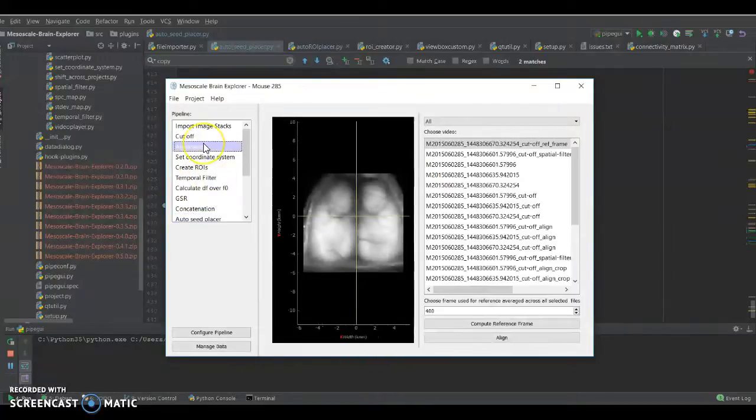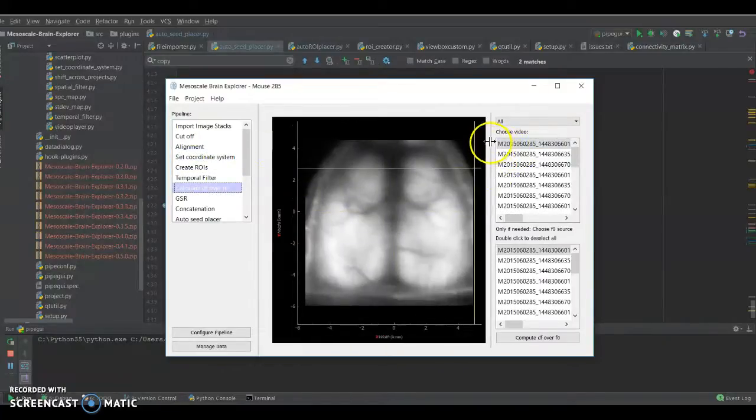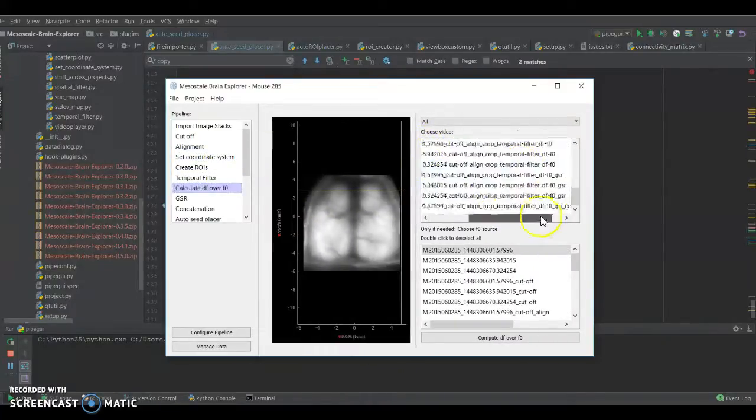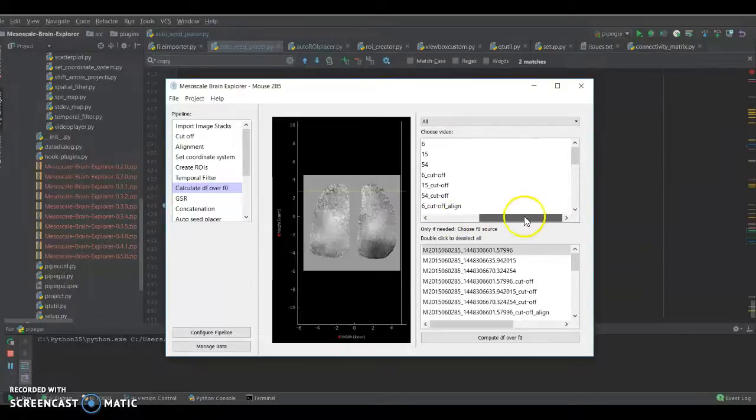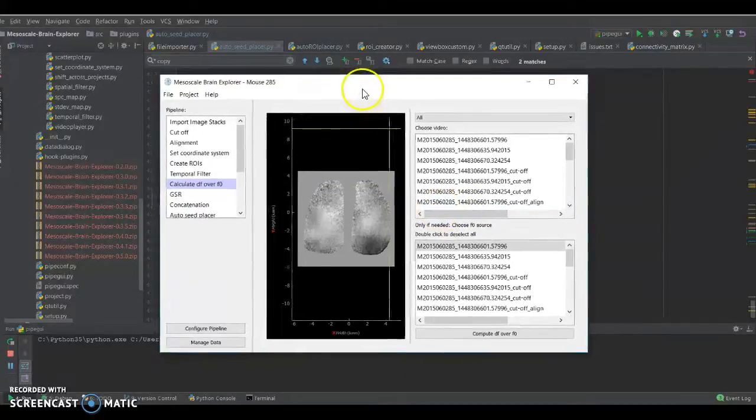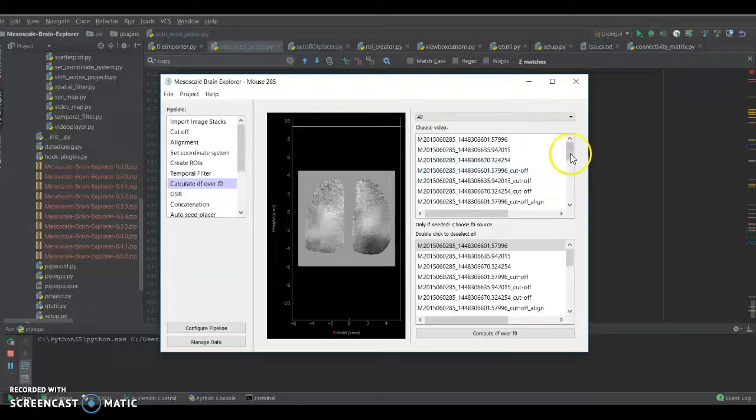A word on what we've done so far before we do that. If you've been following along, you'll notice that all of the files have been saved to file. Now this may not be a problem when we only have 3 files. But say we have something like 31 files, and each one of these files is a gigabyte large. Then this starts to get very large very fast. Now, MBE is very well suited to dealing with files that are a gigabyte large and processing them. You just have to have enough RAM. But the storage problem still remains.